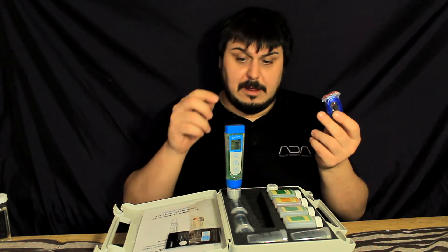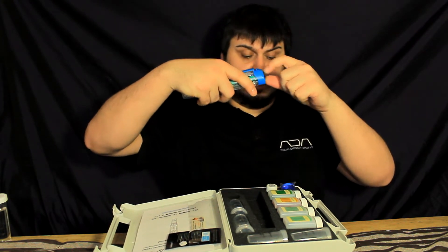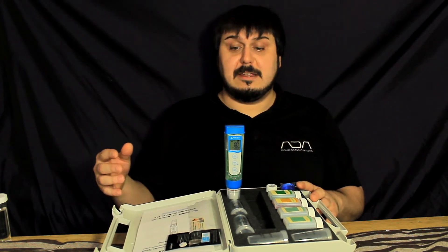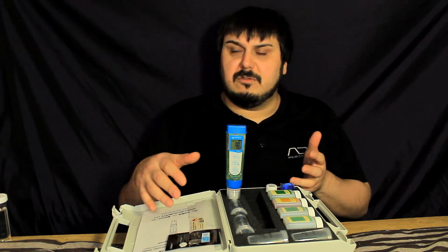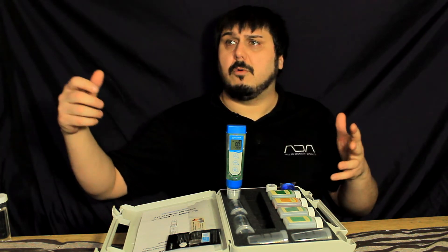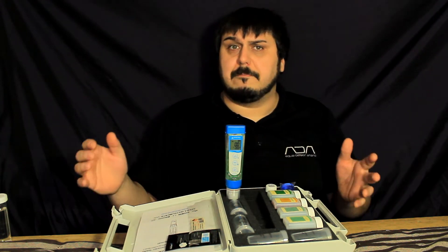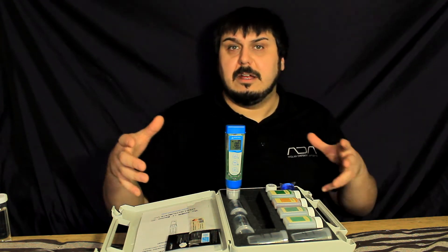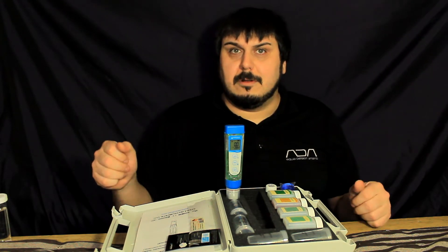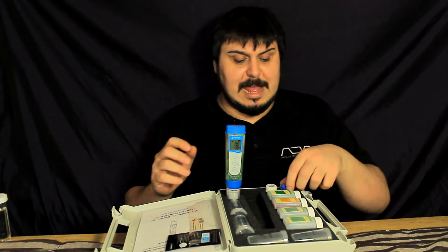Next in the box is a lanyard, which is really cool. It allows you to put it around your neck and there's a hole where the lanyard hooks on, so you won't accidentally drop your meter into a lake or anything like that. This is really designed for field use, especially with the Bluetooth connectivity — you can leave your device away from the lake or water source while taking samples. This instrument has a wide variety of uses, from dairy all the way to wastewater management, so it's a very versatile unit and you definitely don't want to drop your meter into a vat.